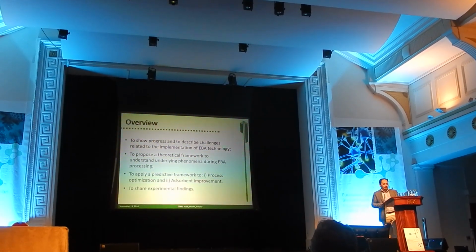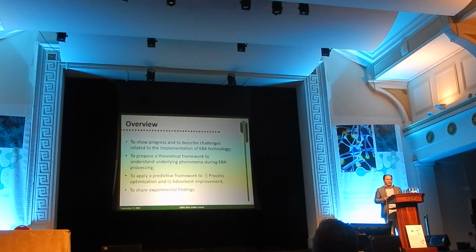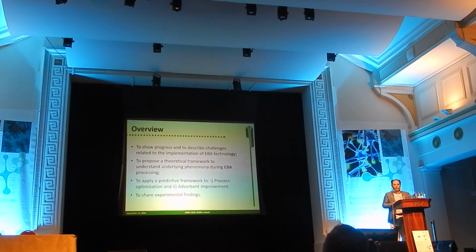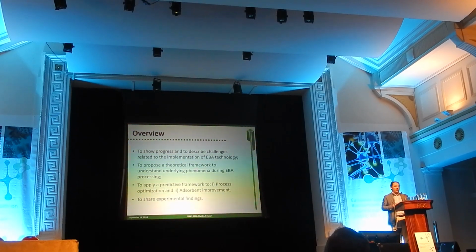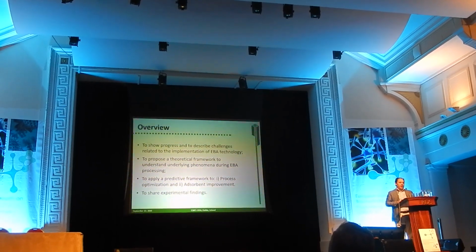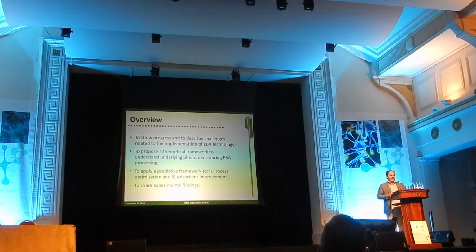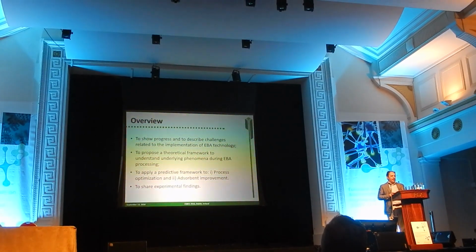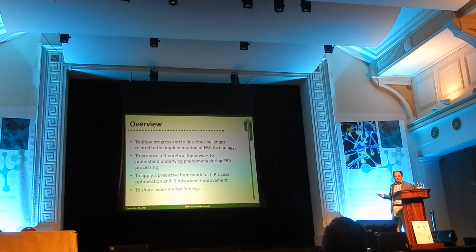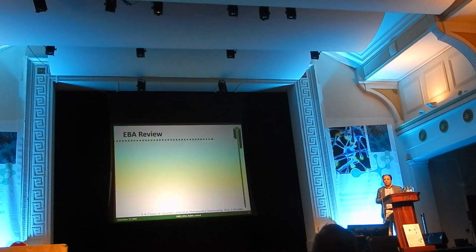Very briefly, I would like to introduce the technique for those who may not be familiar with it. Then I will try to put my finger on the problems that we still face with the implementation of this technology, and then show how we are dealing with these problems and which strategies we are implementing to increase expanded bed adsorption performance in real practice. And of course it's always good to share some of our experimental systems and experimental work.